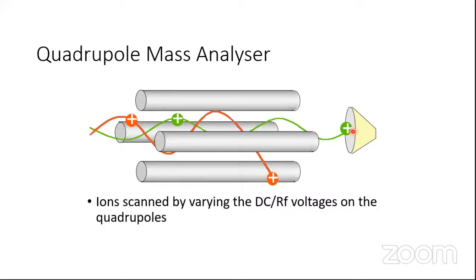As soon as the compound elutes from the column, I am able to measure the mass spectra on it. And if the peak width is just 1 second, that means the peak has started coming, gone up and come down. As I count one, the peak is over, and within that count I am measuring 10 mass spectra on that peak. So it is very, very fast. It is what we call on-the-fly analysis. It does the analysis very, very fast.